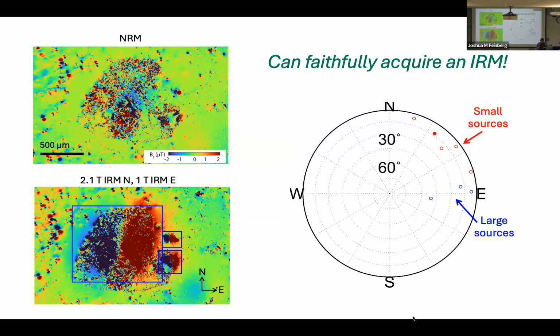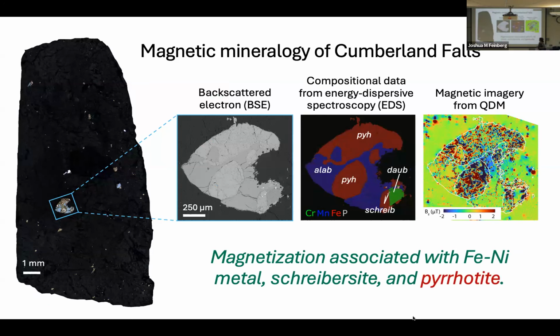So that's encouraging. But I actually want to step back. What's really interesting here, I kind of glazed past it, I don't know if anyone caught it, is that we see pyrrhotite in this sample.